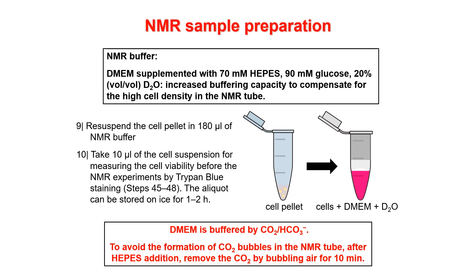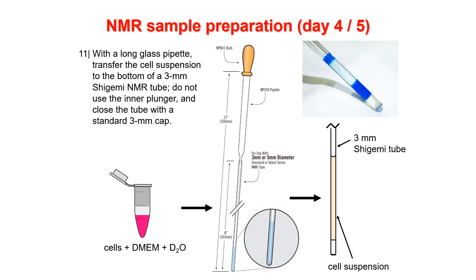Now that the buffer is ready, we resuspend the cell pellet with 180 microliters of NMR buffer, pipetting slowly because cells don't like to be pipetted too quickly as that would kill them. Before putting them in the NMR tube, we take 10 microliters of this cell suspension to measure cell viability by trypan blue, and this aliquot can also be run on a gel to check protein levels by SDS-PAGE. Then you transfer the remaining suspension to the NMR tube.